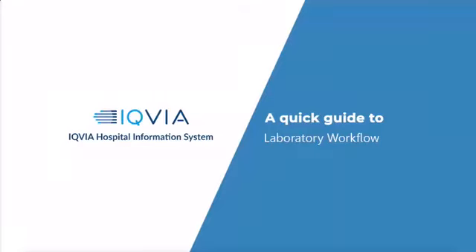Welcome to IQVIA Hospital Information Systems video. In this video, we will see the laboratory workflow.